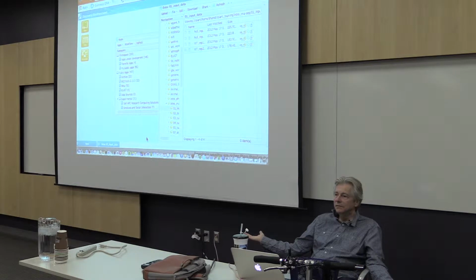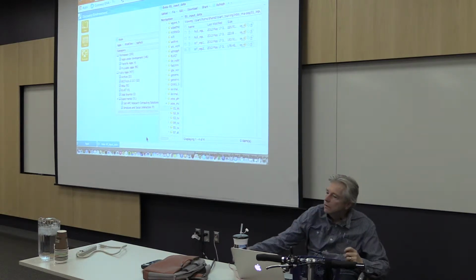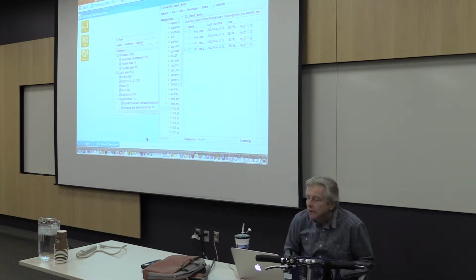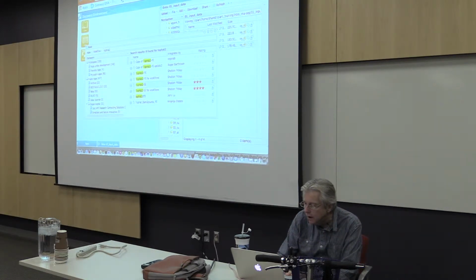Yeah. And so in this case, you're saying repeats as in just small repeats, not duplicated sections of the genome? Yeah, probably. The parts that are going to be masked out are generally the small repeats. Gotcha. And so that's how you run TopHat.